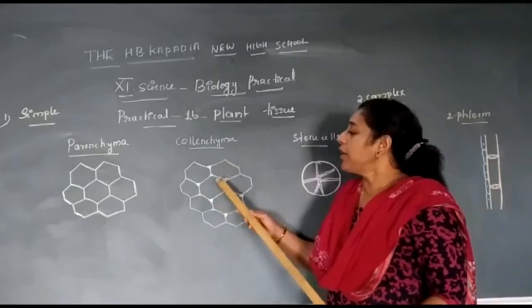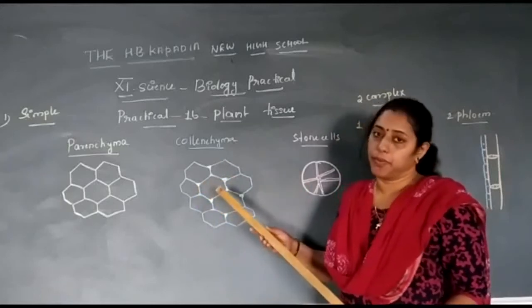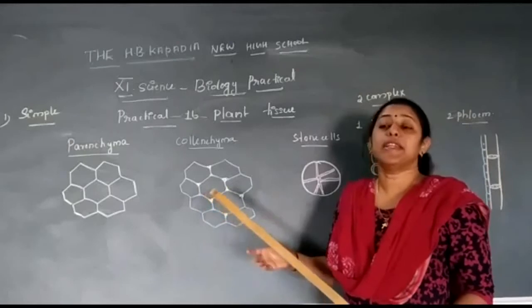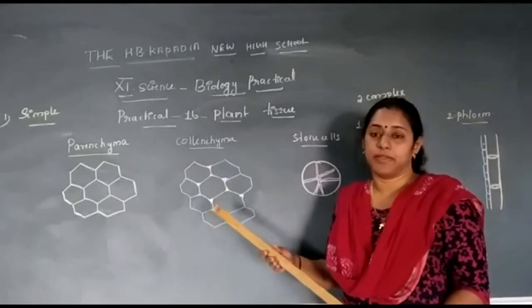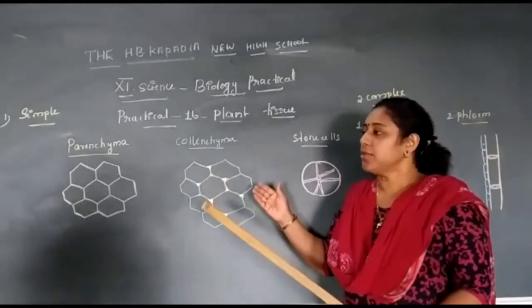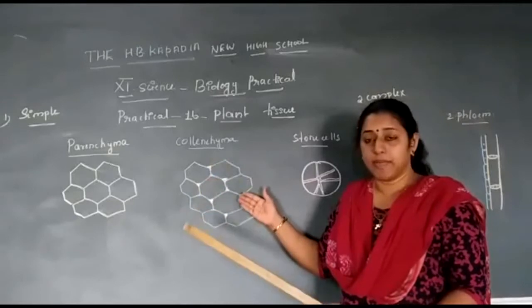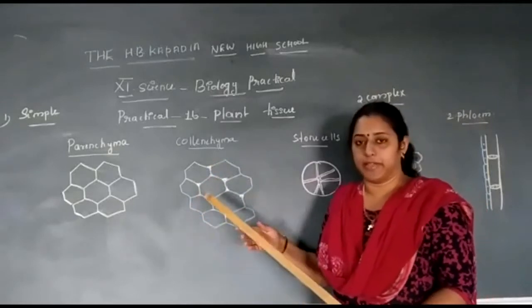Now, this collenchyma, what is its function? This is giving mechanical support, and also it is rendering flexibility. This is not fully thickened, only some areas are thickened. So this is thick. So this is providing structural stability and also flexibility.